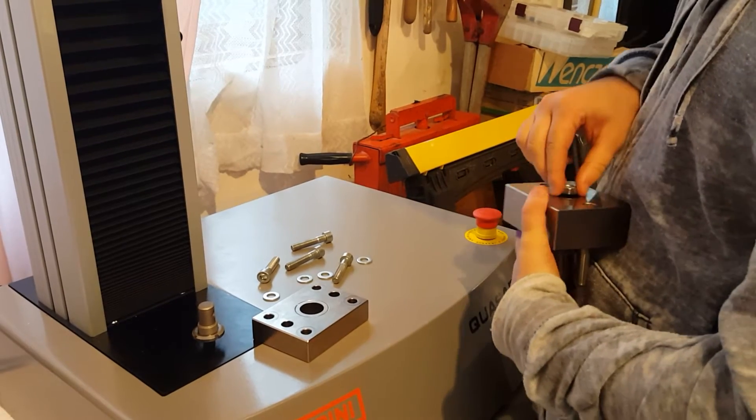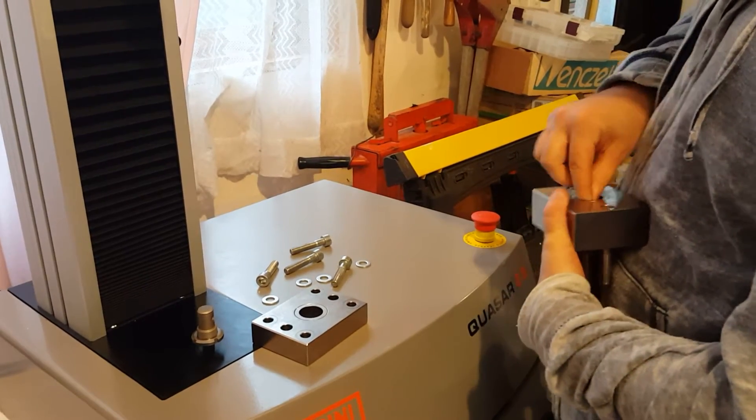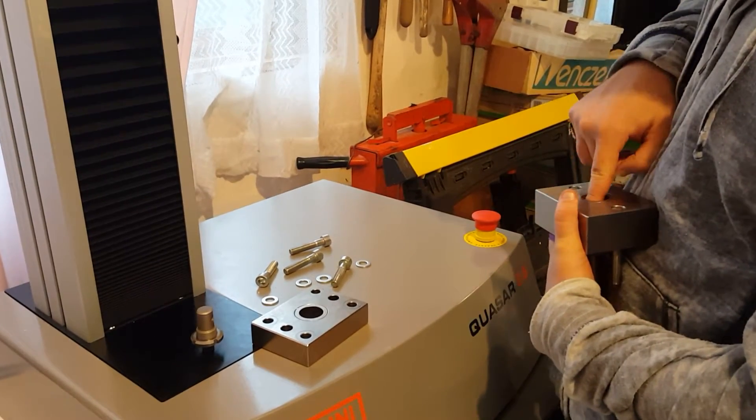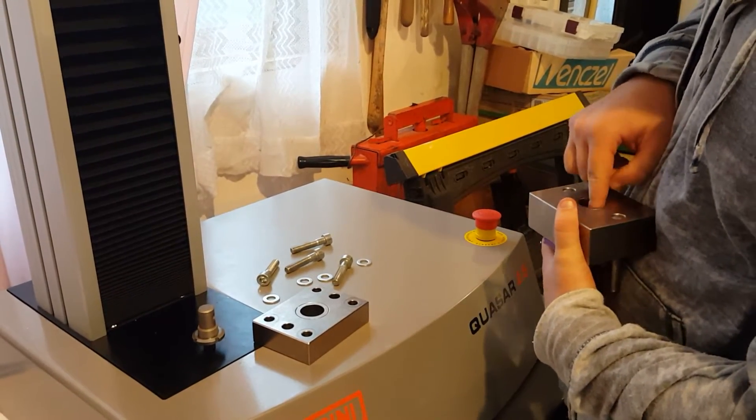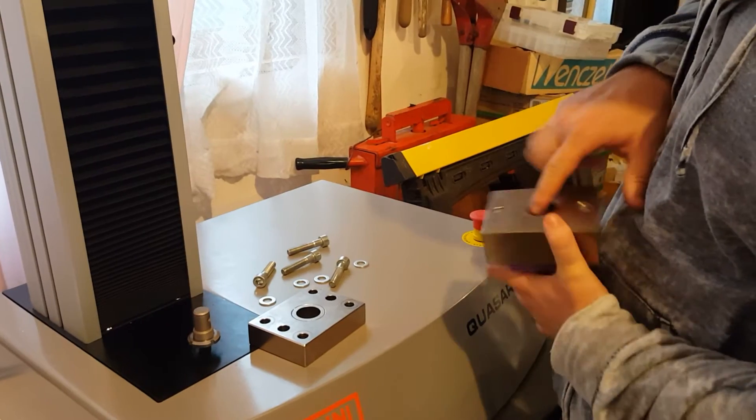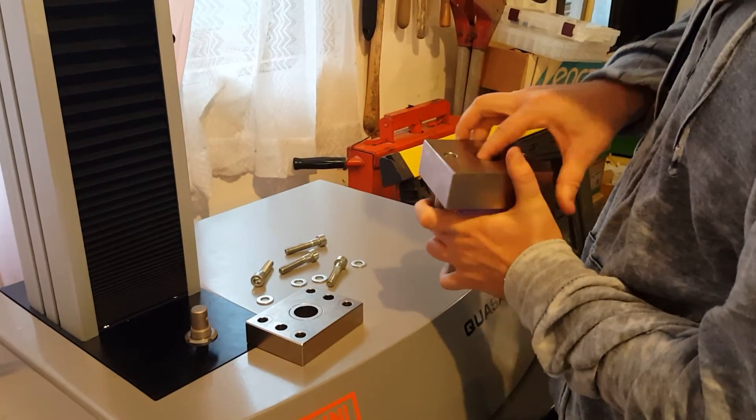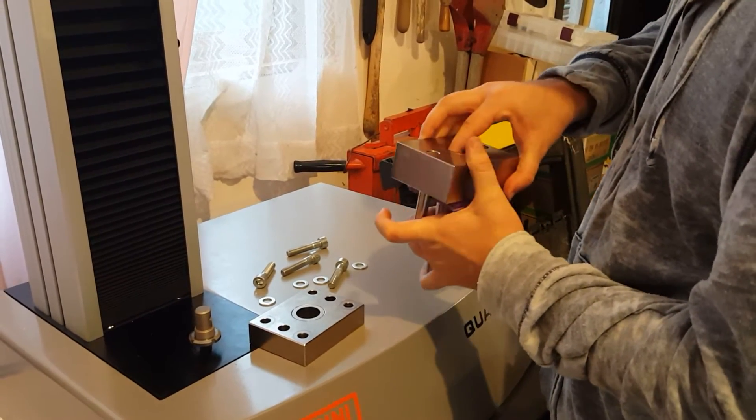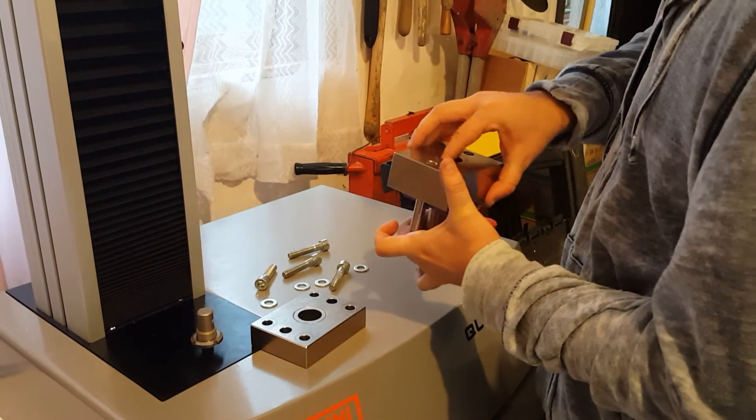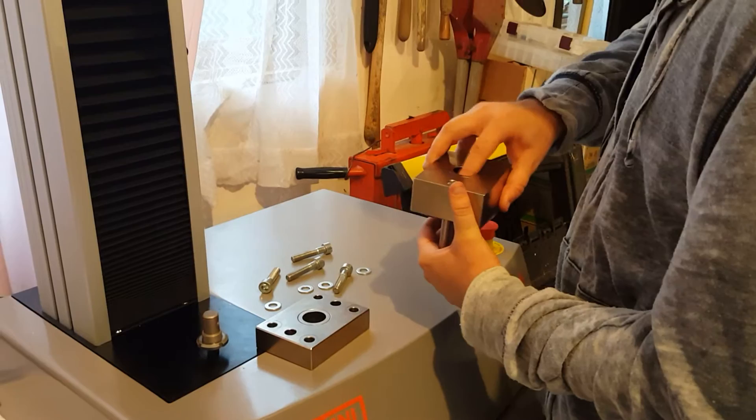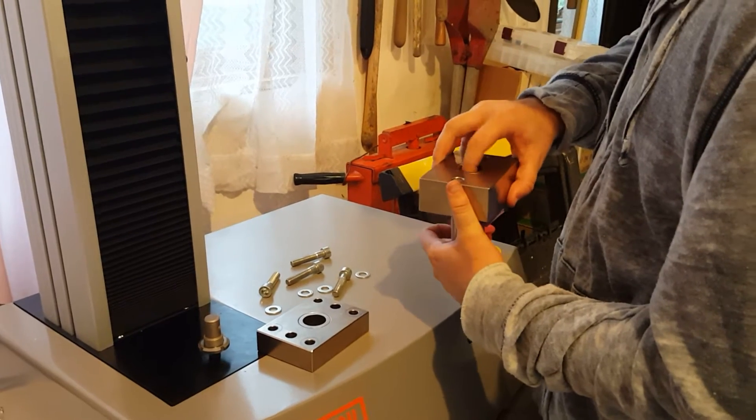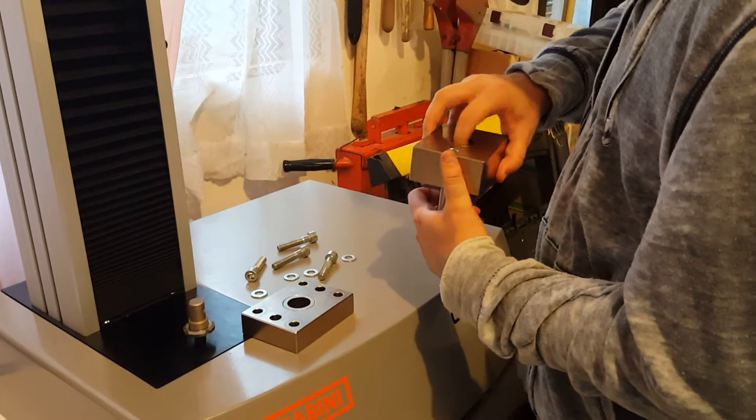We're going to get the nut to attach onto the bottom here. So it's kind of tight, but if you're having difficulty you can just use a socket wrench to get it done. We'll go ahead and tighten that on.